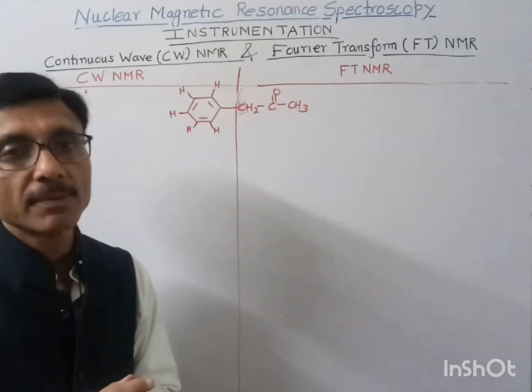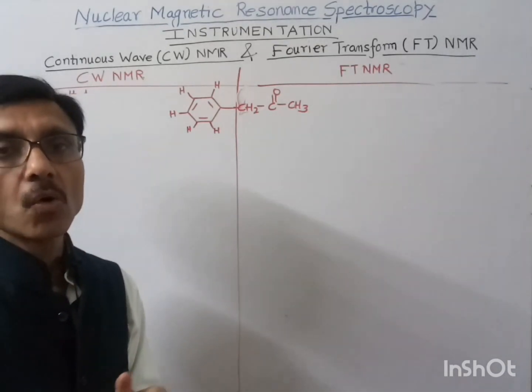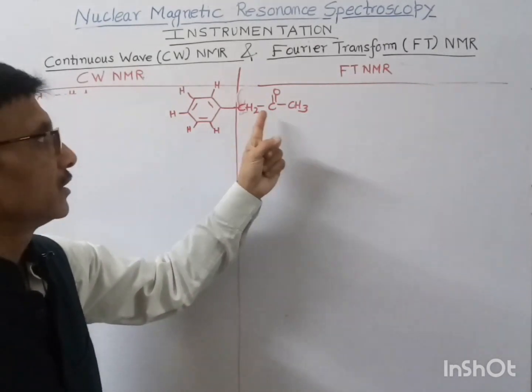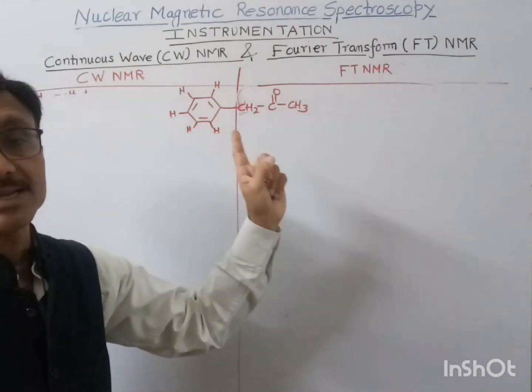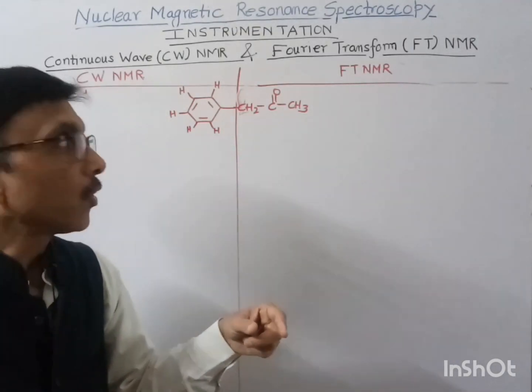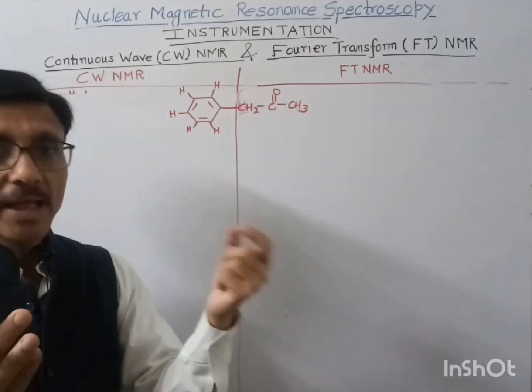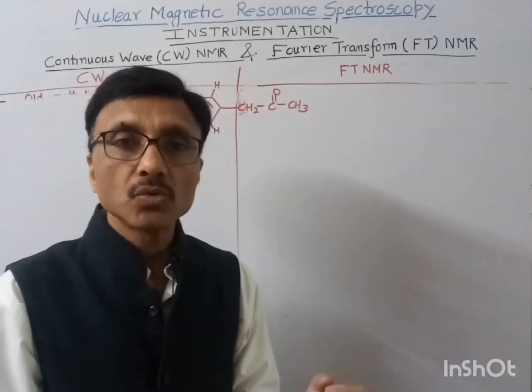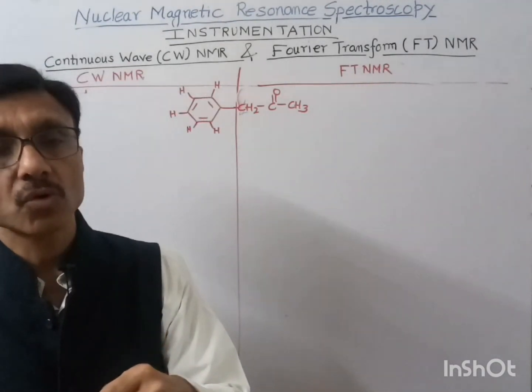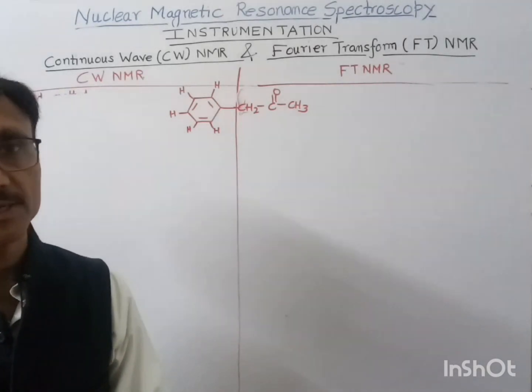But in the FT-NMR spectra, all 3 types of proton are scanned simultaneously. We can say all 3 types of proton are excited simultaneously, and they also relax simultaneously. The decay of all the protons also takes place simultaneously, and that is called free induction decay.